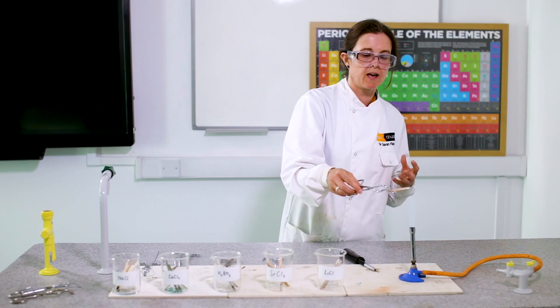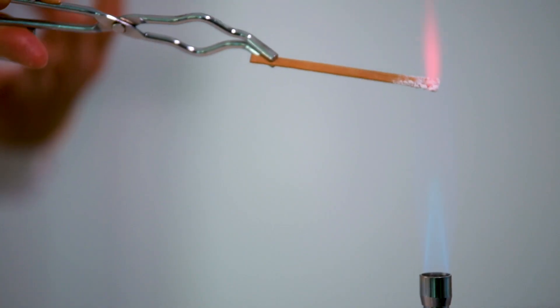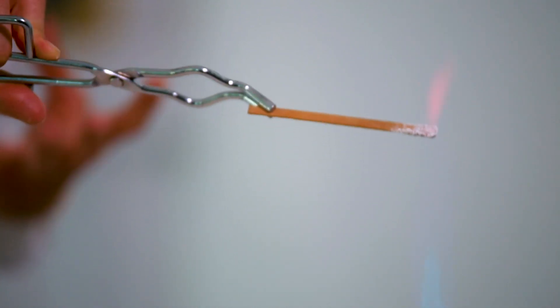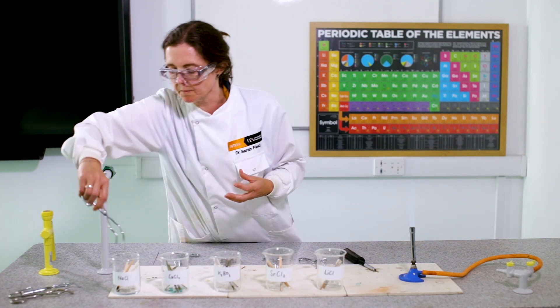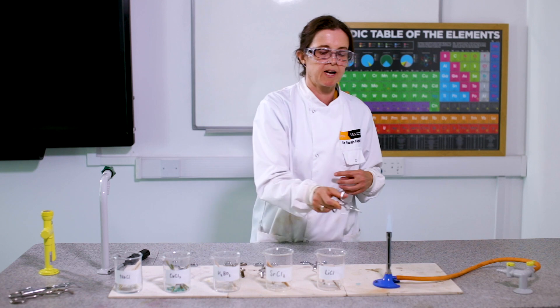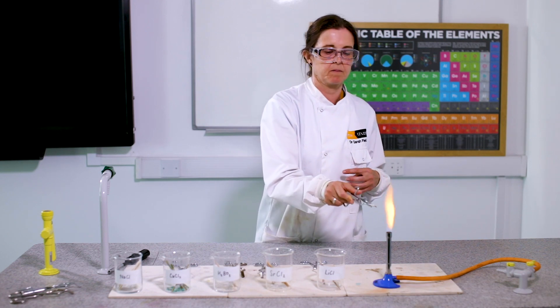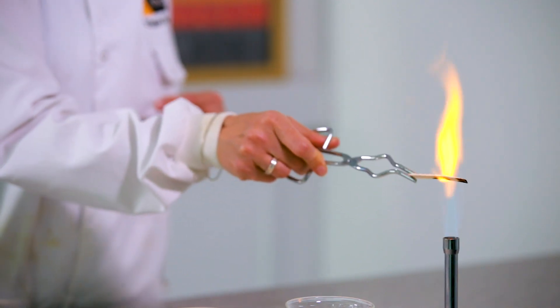Lithium has a red flame, quite similar to strontium, so maybe the lithium electrons have gone up about 15 floors for their party. The last one is sodium, which has a really yellow flame — it's crackling a bit as well. Look at those sparks!